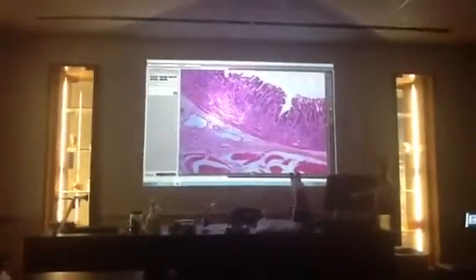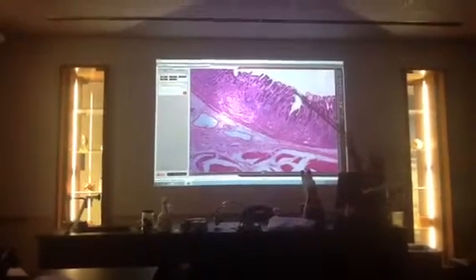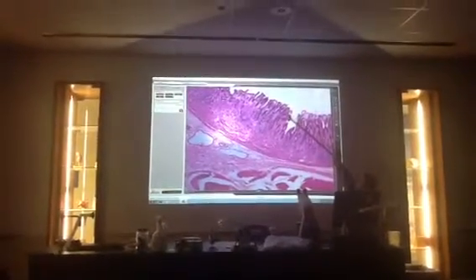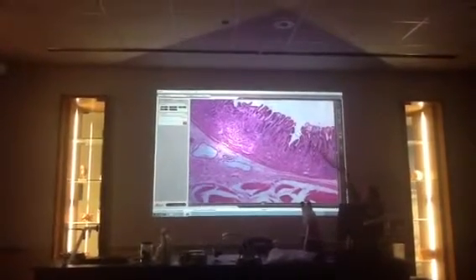Same types of structures we saw in the esophagus. We'll have an epithelial layer, a lamina propria, the muscular mucosa layer, and then various structures within those. So the opening that would be asked would be the opening that's up here. The gastric pit goes down this way, and it follows that opening for the pit. So again, what's the opening?